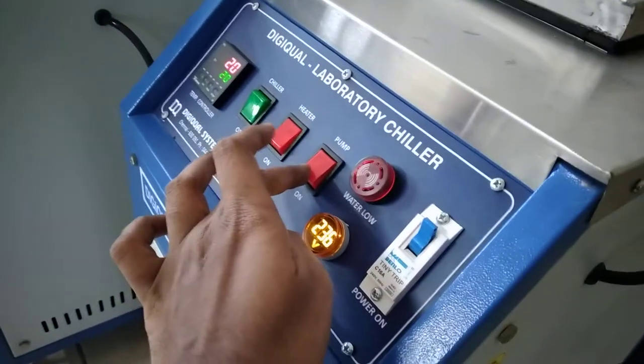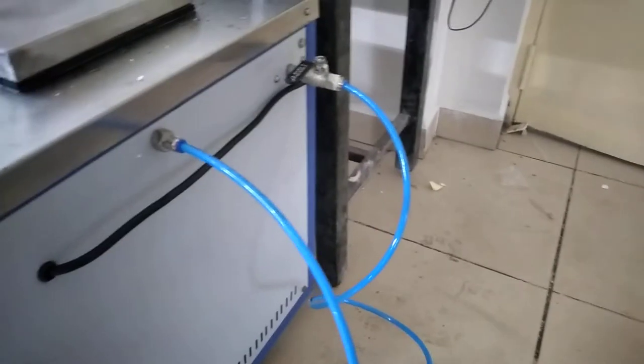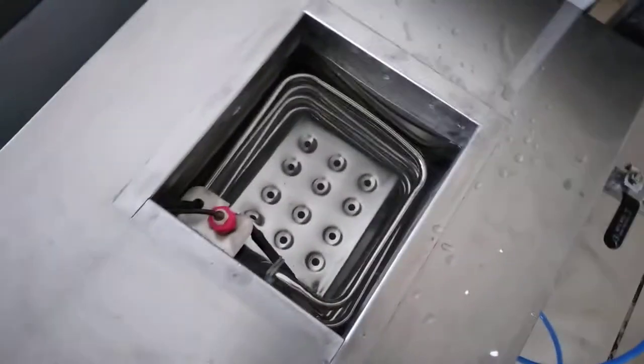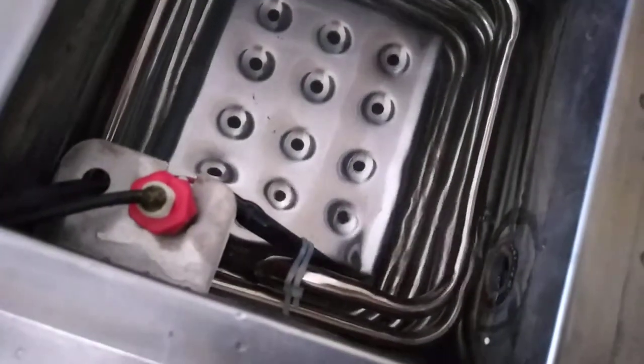Now we are going to switch on the pump. The water is recirculating now. We need to open the ball valve. So the water is recirculating — you can see the water flow inside.